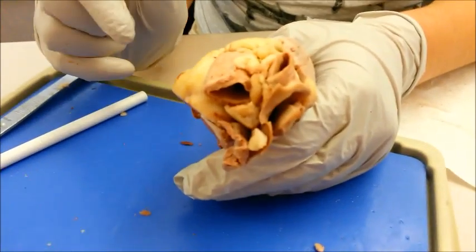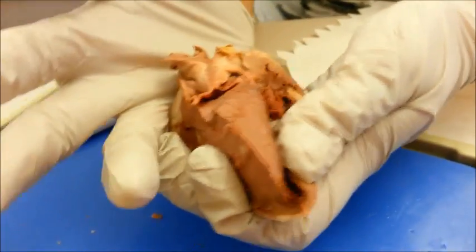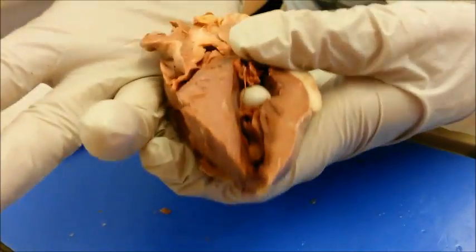The pulmonary valve is one of two valves that allow blood to leave the heart by the arteries. This valve only allows blood out one way, meaning blood cannot go back into the heart through this valve.